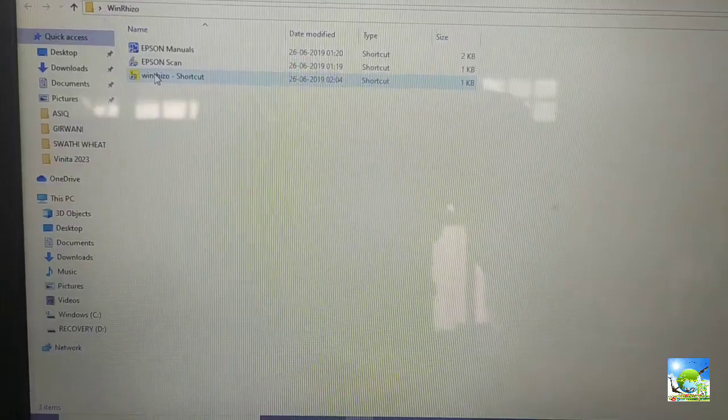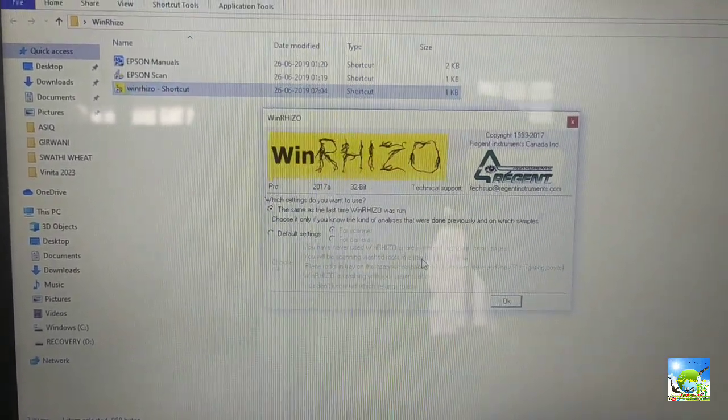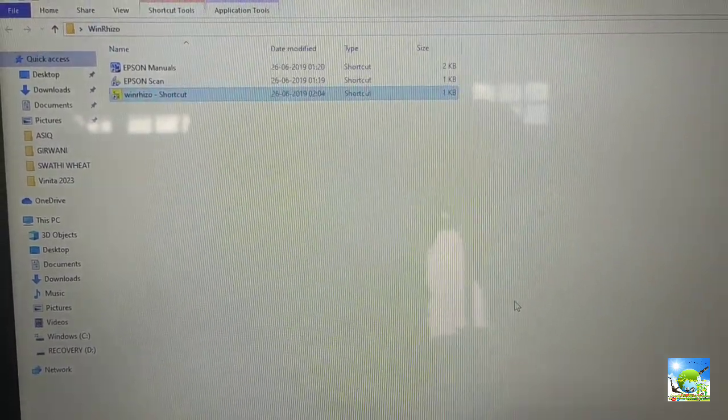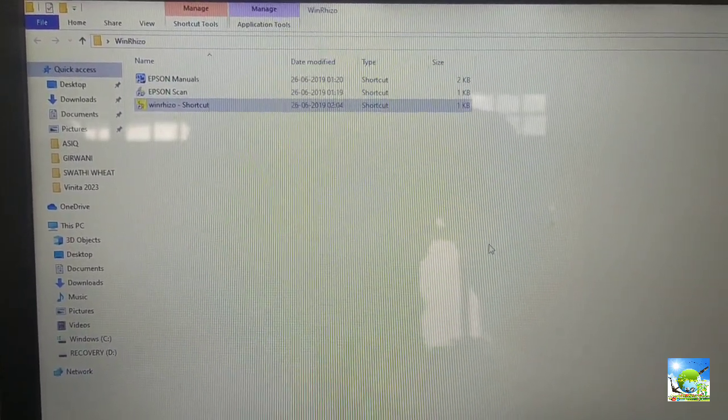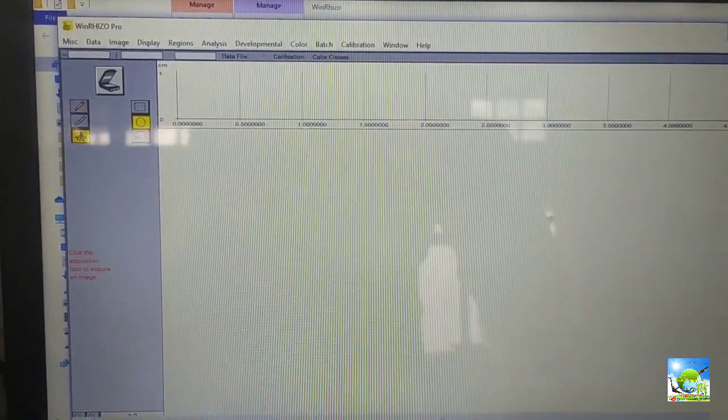Open the WinRHIZO software, then click on Epson Perfection and select it. If the root scanner is not perfectly connected to the computer, then only one option will appear and it will not allow you to scan.